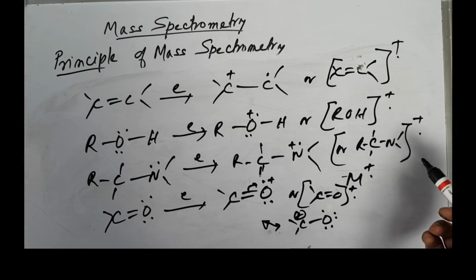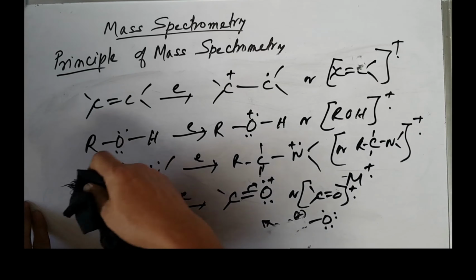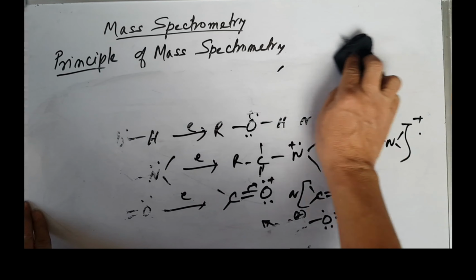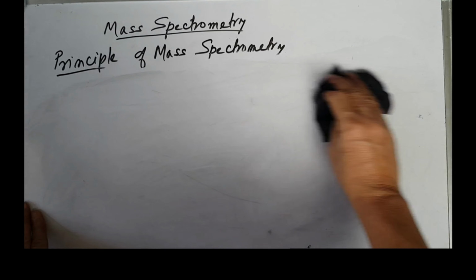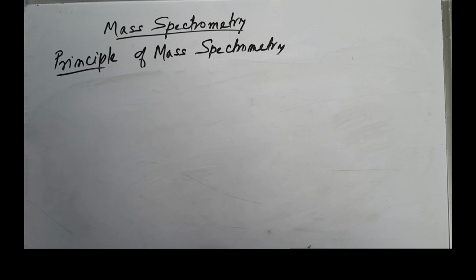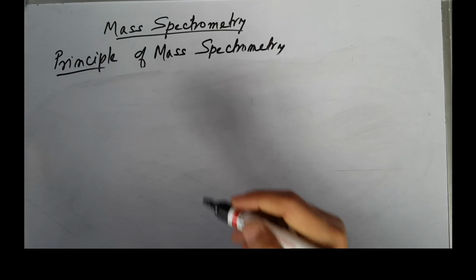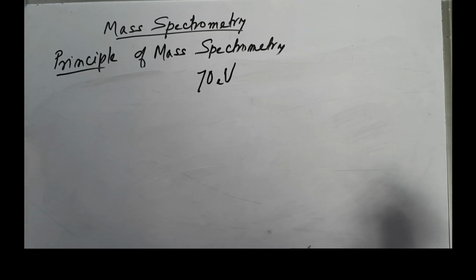These molecular ions can undergo further decomposition or fragmentation to give other ions. So in mass spectrometry, we study these fragment ions and the molecular ions by bombarding the sample species or natural molecules with high energy electrons. The high energy electrons used are mostly around 70 eV, so that they can decompose mostly organic compounds, or covalent bonds, which can be decomposed by this method.